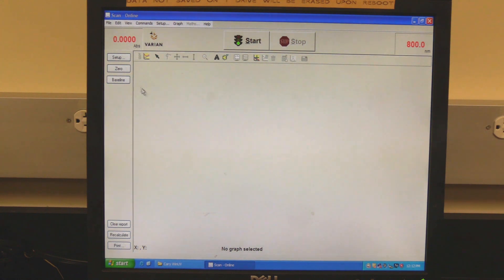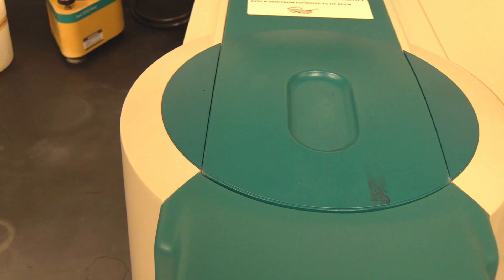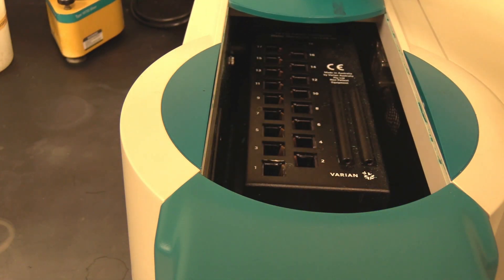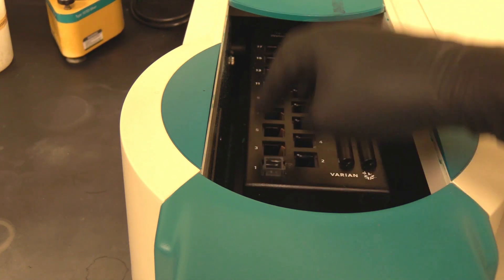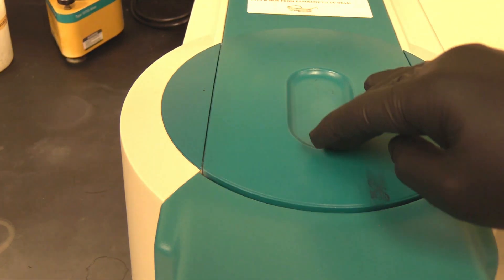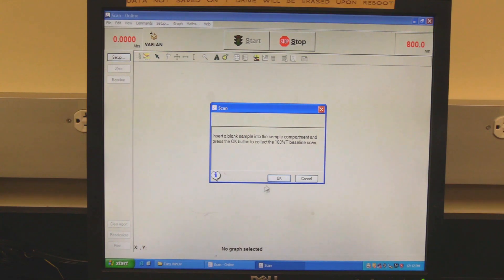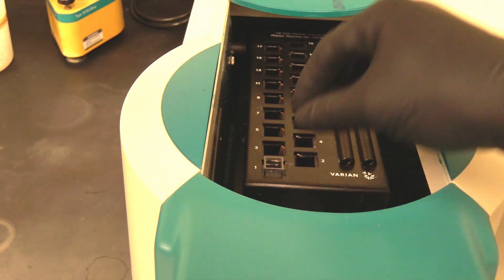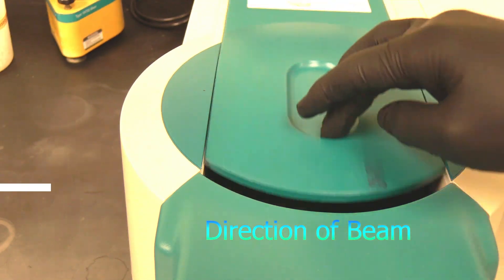Click on the Baseline button. The software will prompt for the operator to insert the blank cuvette. Slide open the sample chamber lid, insert the blank cuvette, and close the lid. Be mindful that the beam path is right to left — insert the cuvette so the clear sides are aligned with the beam direction. Click OK to make the baseline measurement and wait for the measurement to finish. Then slide open the sample chamber lid.